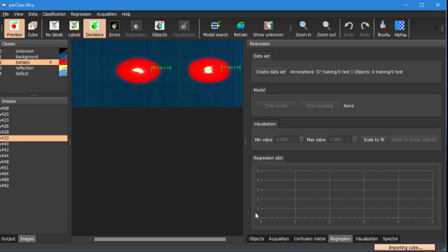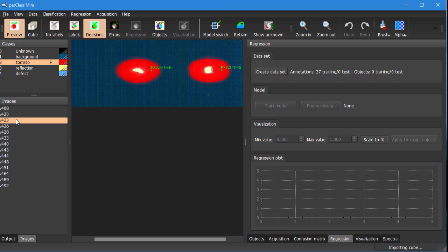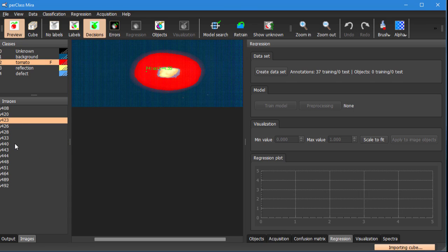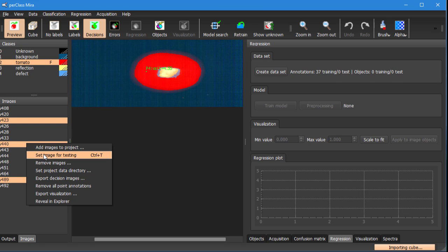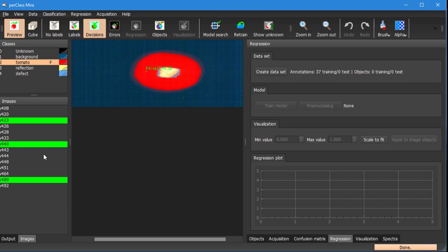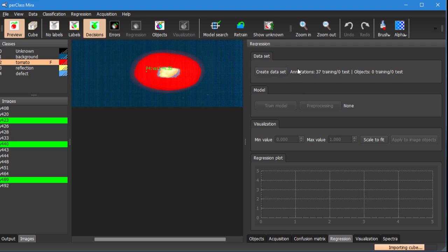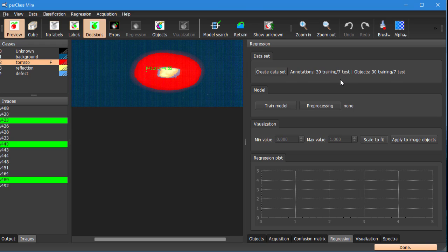As with any modeling it's useful to select several scans and flag them for testing so that we have some independent validation data to judge the quality of our model. And then we create the regression data set. We see that in our data we have 37 annotations in total and this is really mapping to 30 objects for training and 7 for testing. Now we are ready to build the regression model.